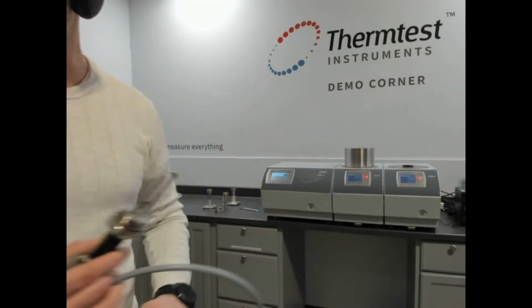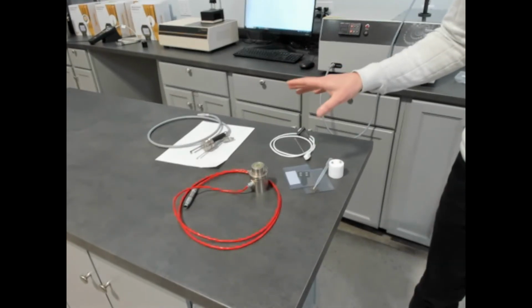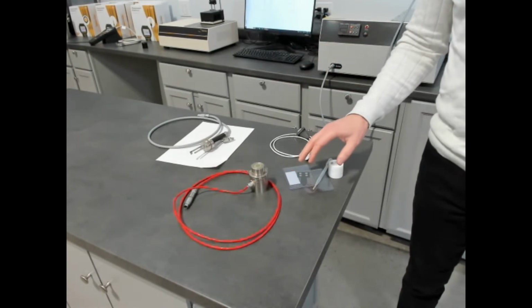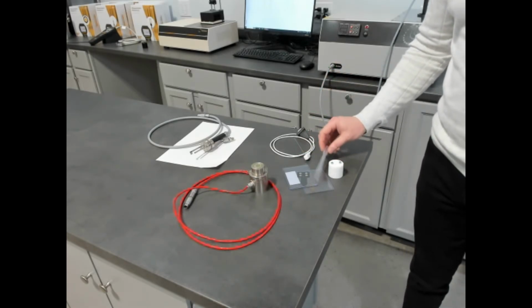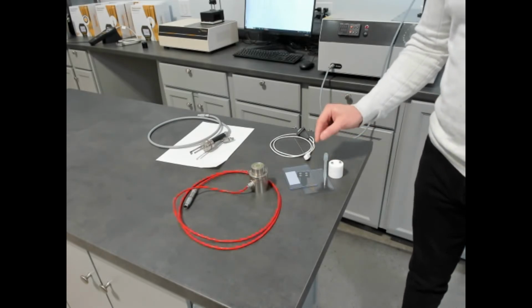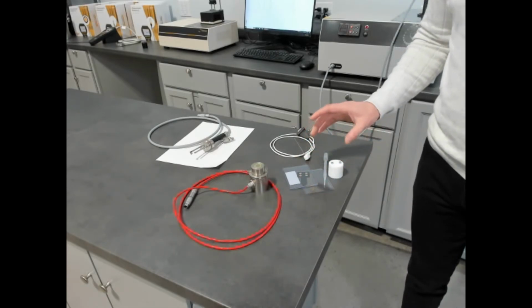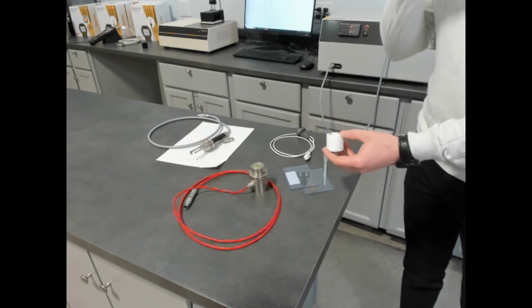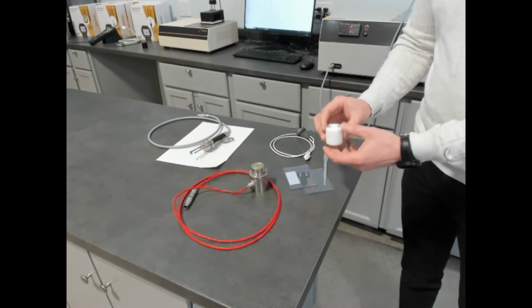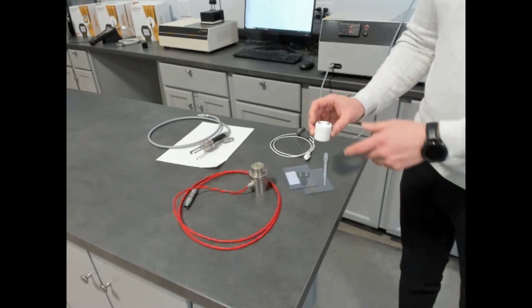So I'm going to put this down, and there's something to talk about when it comes to fluids, and that is the other methods of measuring fluids that are used in the market. We have our transient plane source. There's multiple makers of transient plane source. The idea being with transient plane source that you limit the amount of volume you measure by using a very small diameter sensor. So very typical is a 4 millimeter sensor. We also have cells that allow you to really minimize the amount of volume, because by minimizing the volume, you reduce the effects of potential convection within the fluid. Again, with the idea of testing lower viscosity fluids.